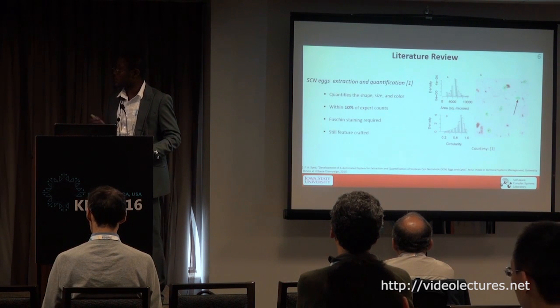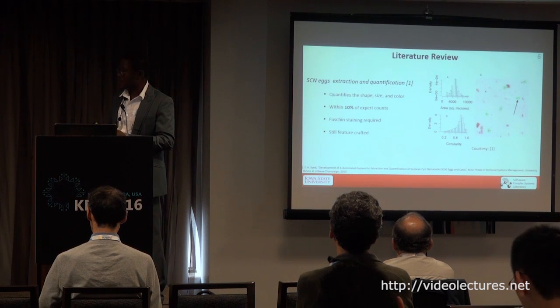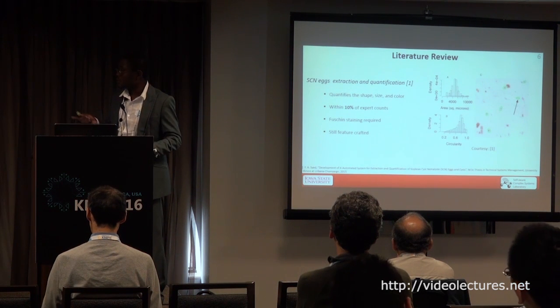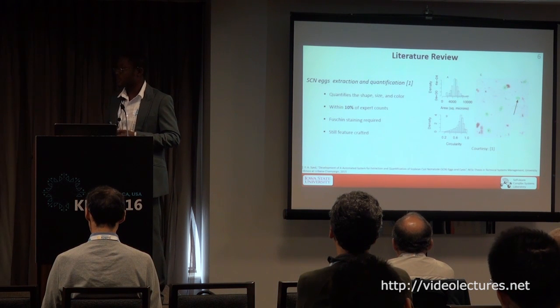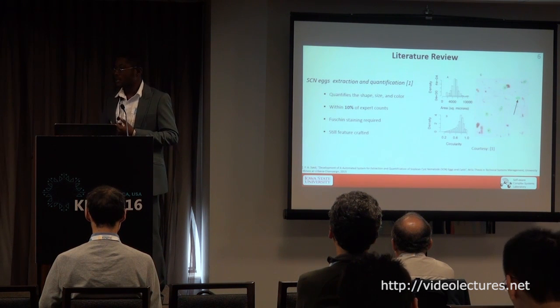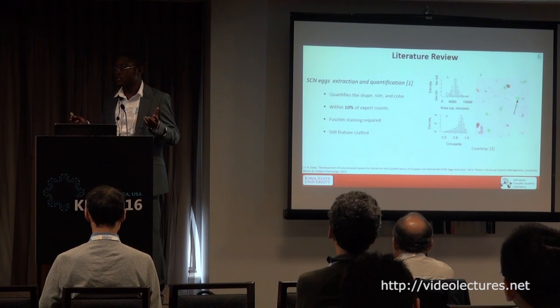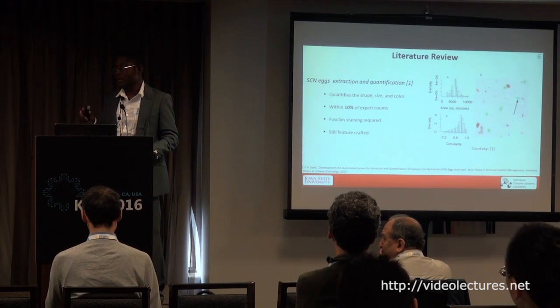However, we noticed that there are defects, like the arrow shown, where the sizes of the eggs or the features vary. So we need something more automated in order to learn those varieties of features, which cannot be captured by that code.